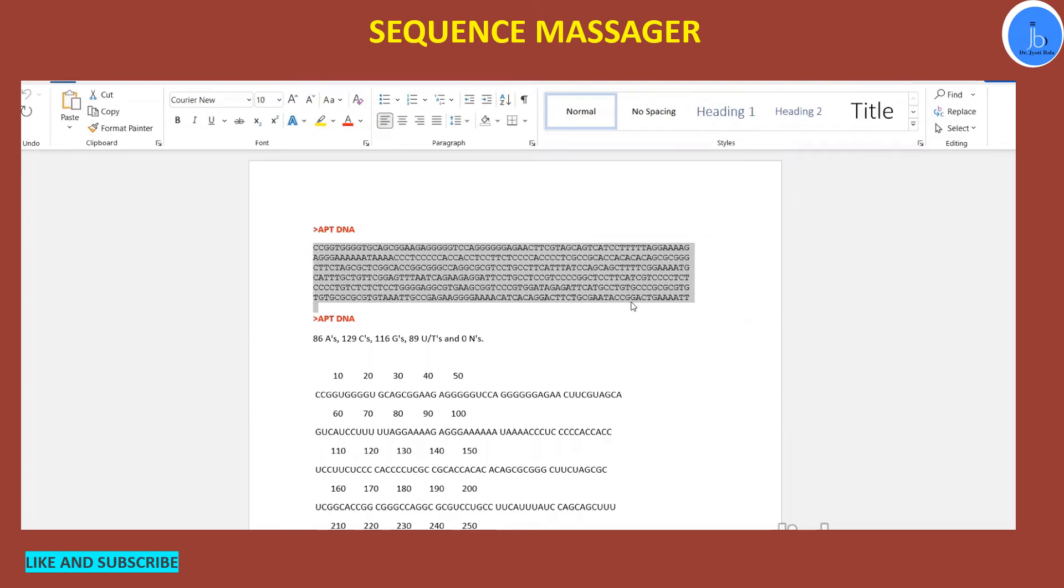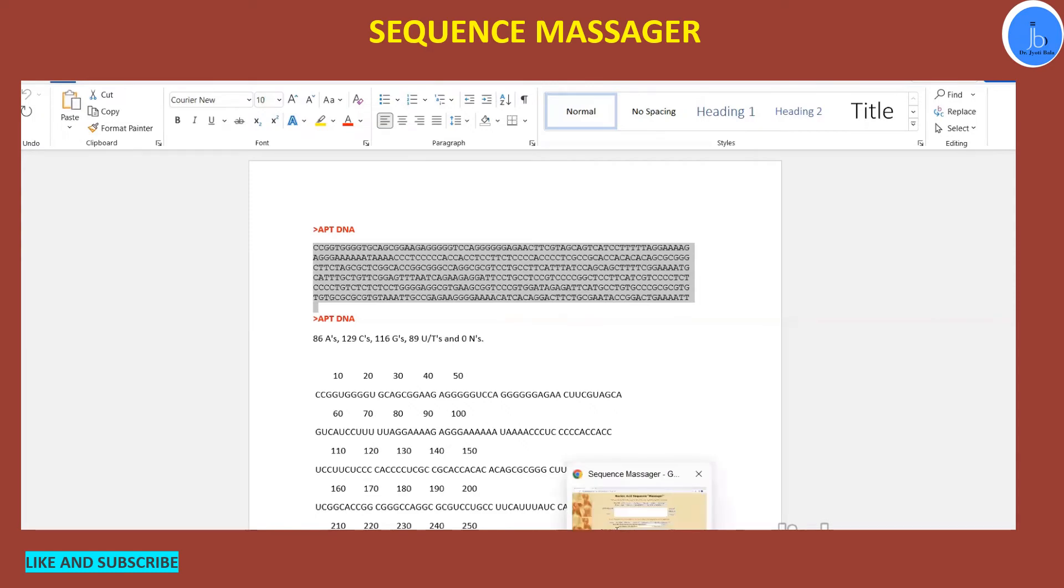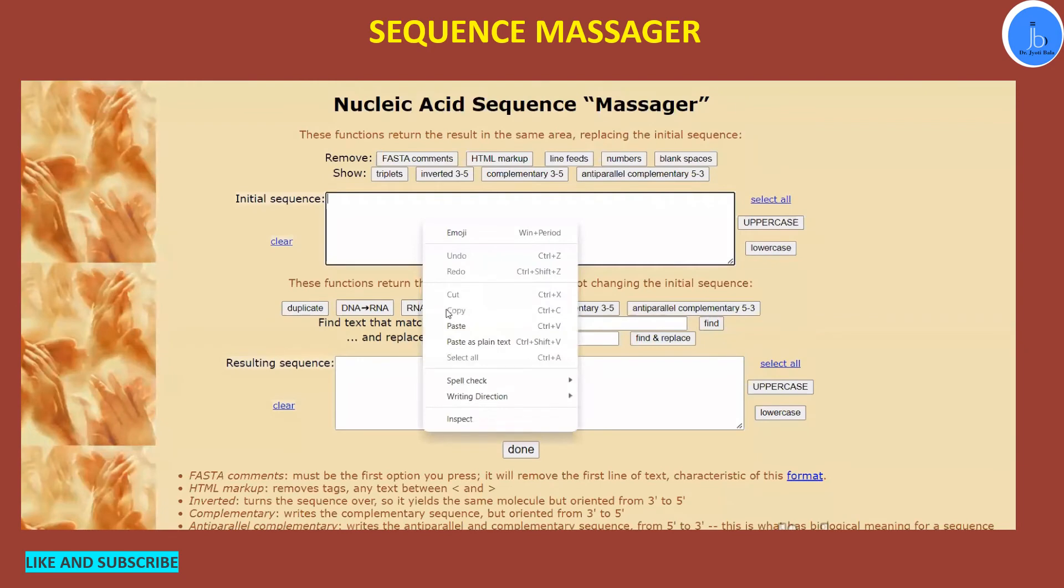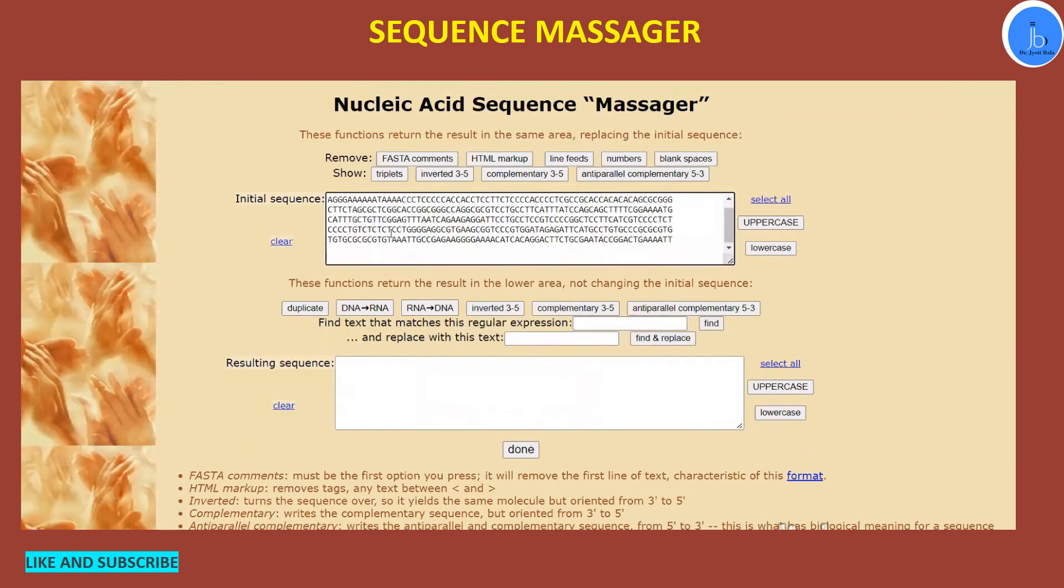And you have to convert these things, DNA to RNA, so not every time is it feasible to do these tasks manually. So Sequence Massager and tools like this are really very useful.